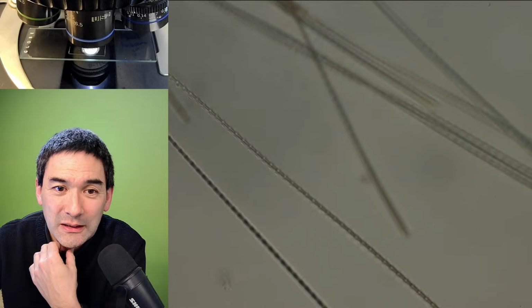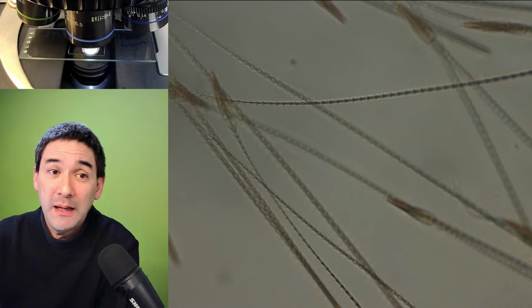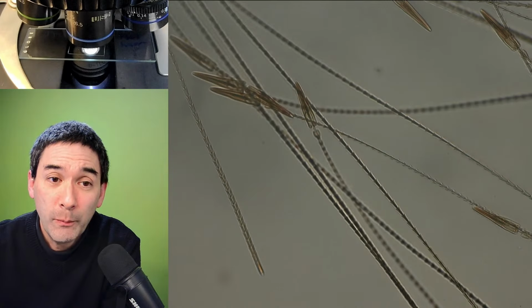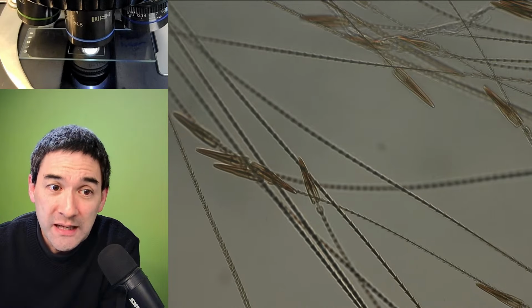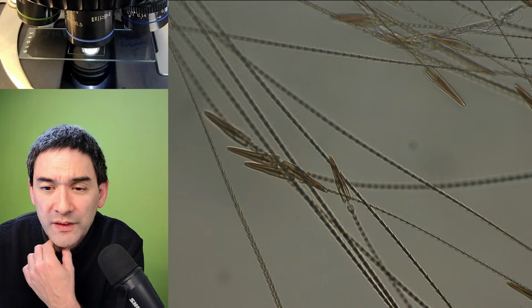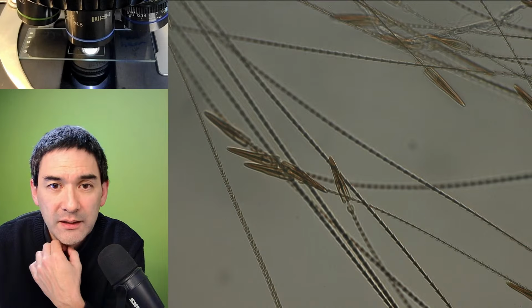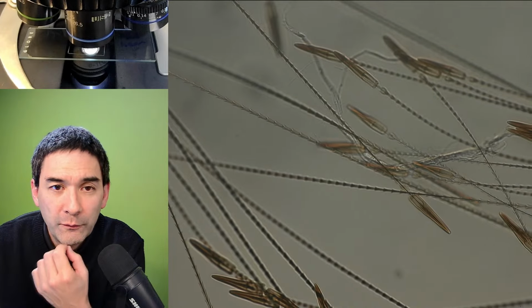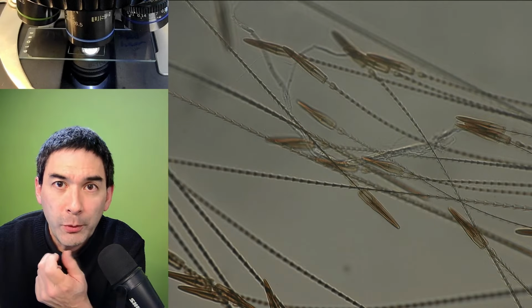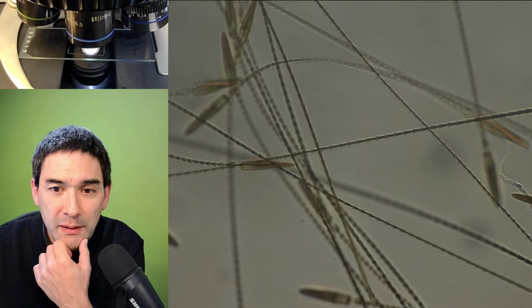In any case, I found quite a few of those, even in a commercial microscope slide as a contaminant. I know it's written with an S, setae, and that's a general term for hair that you find in arthropods, insects, and spiders.